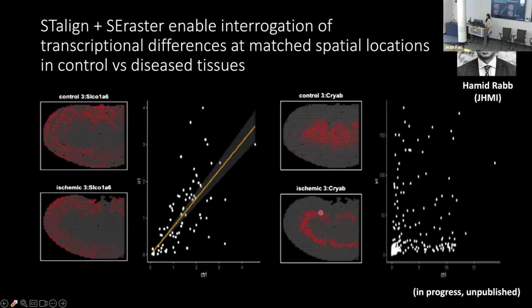Yeah, interesting. I think that's where it's really fun to do this big data search, so we can actually look for all the genes that are changing in their spatial pattern, run our gene set enrichments, and do that in compartment-specific manners. There are definitely a lot of fun things to dig into. If you have hypotheses, I'd love to look into it.